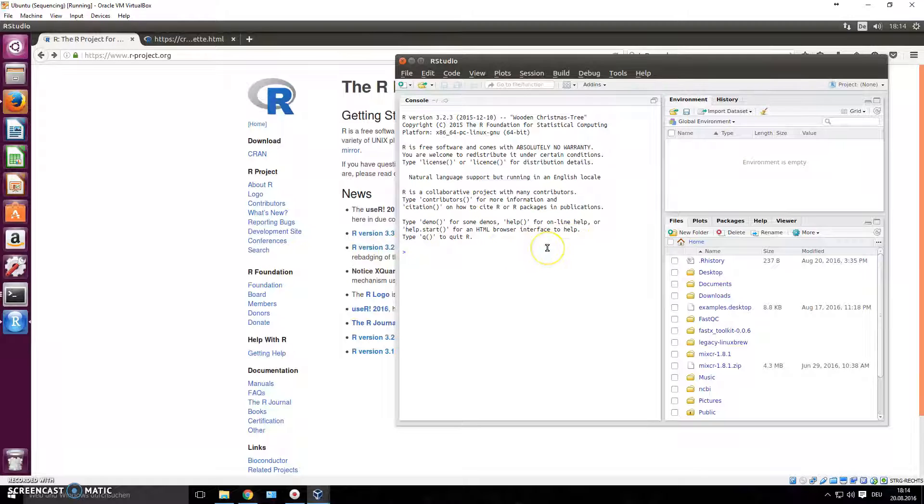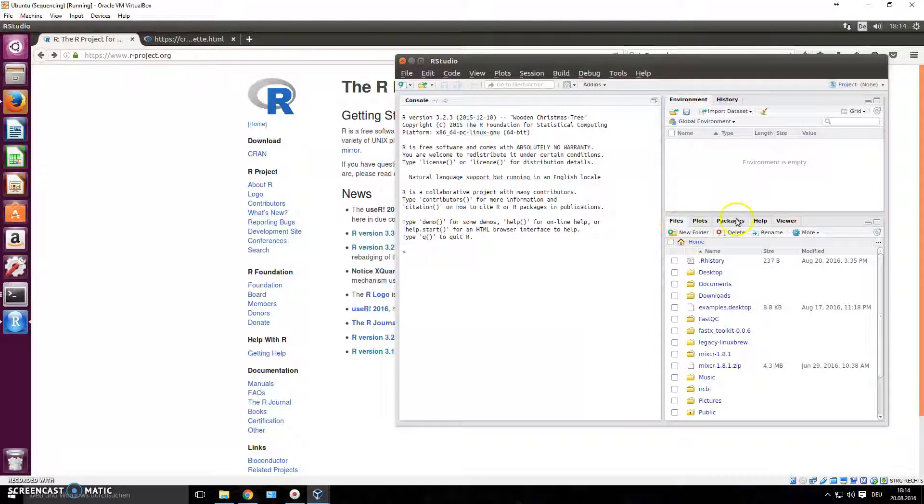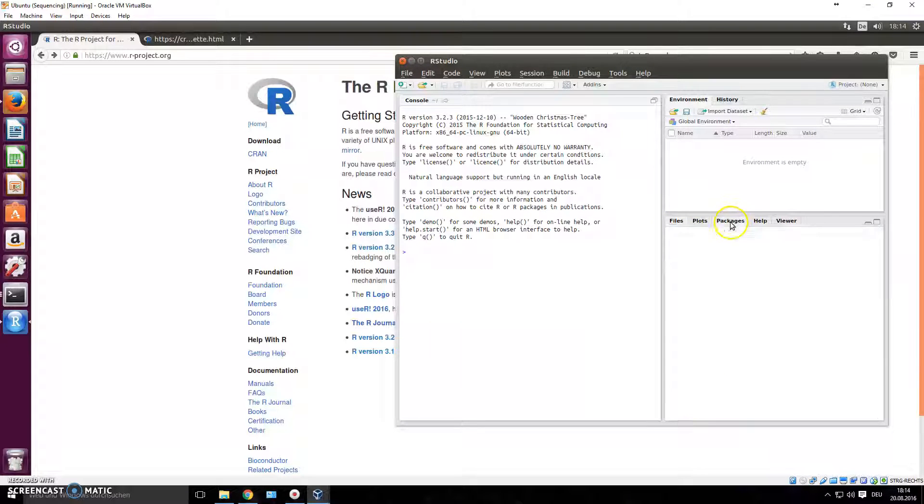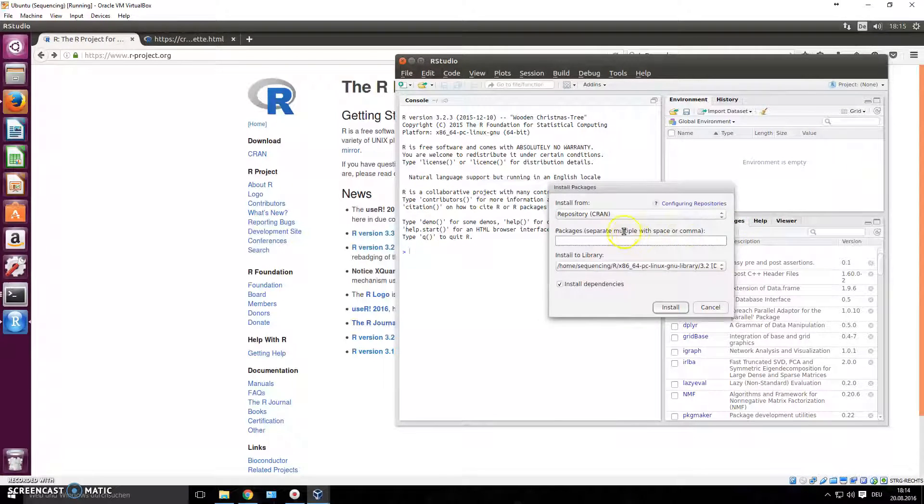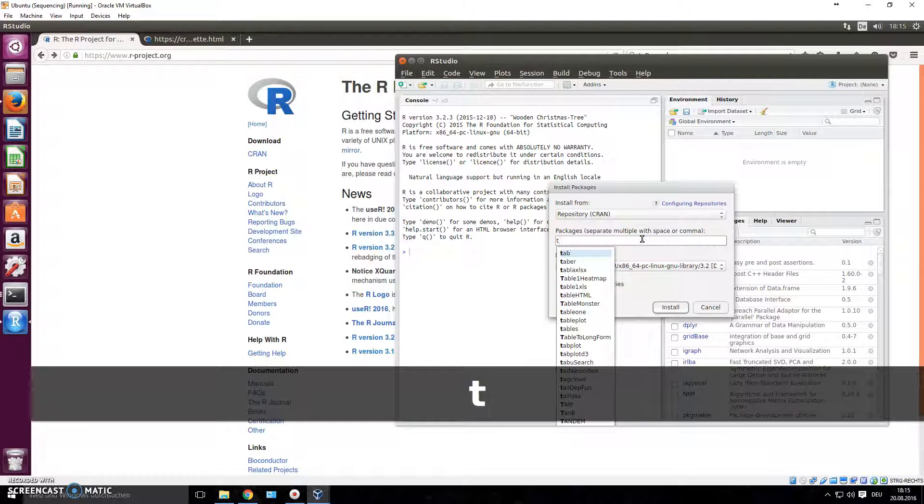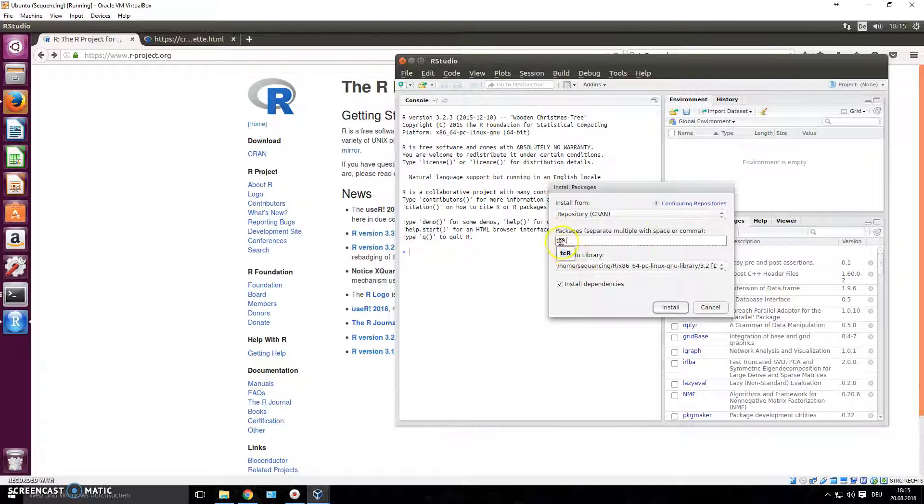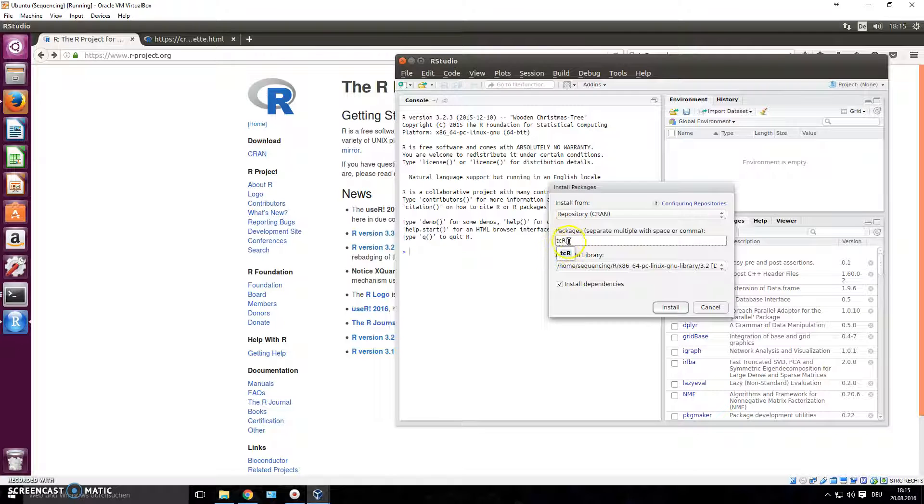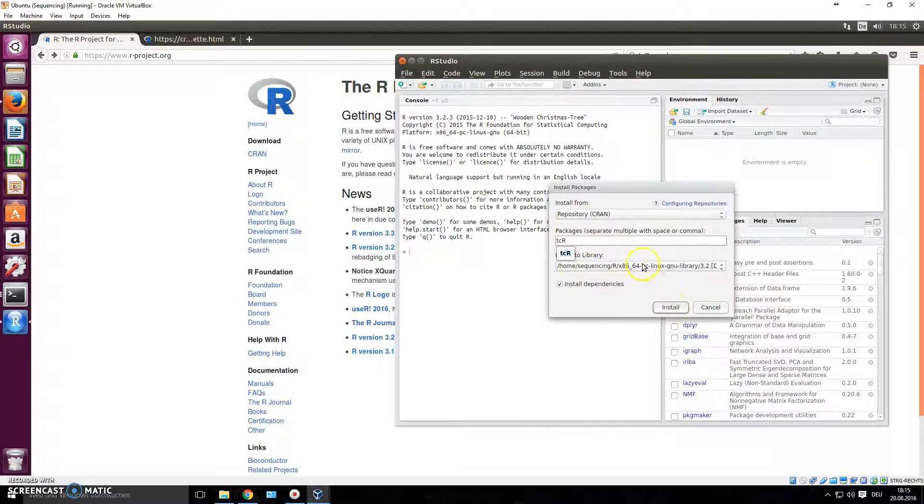So how do you install the package? You could go down here into packages, click this right here, and then click install and choose the repository you want to install from. CRAN is fine, and if you type in the names of the package you will already get a suggestion. It's written tc and R is in capital letters, so you could just click install from here.